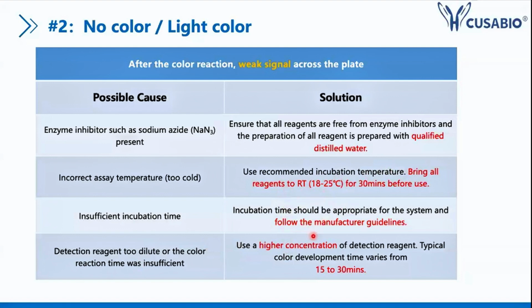Another thing is that usually with the kit, the manufacturer will give you proper guidelines about how long the incubation time is and how long the color development time is. So just be sure to follow them to get your experiment to work.